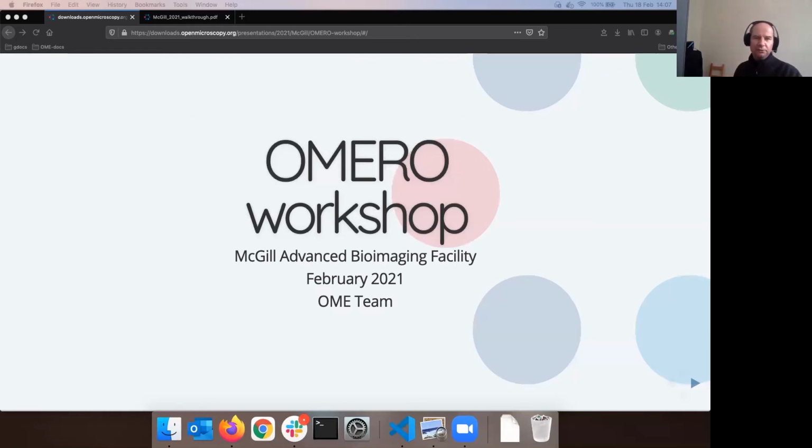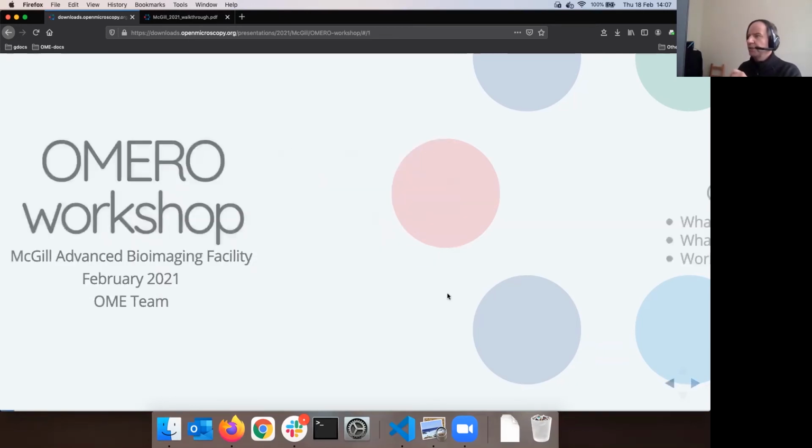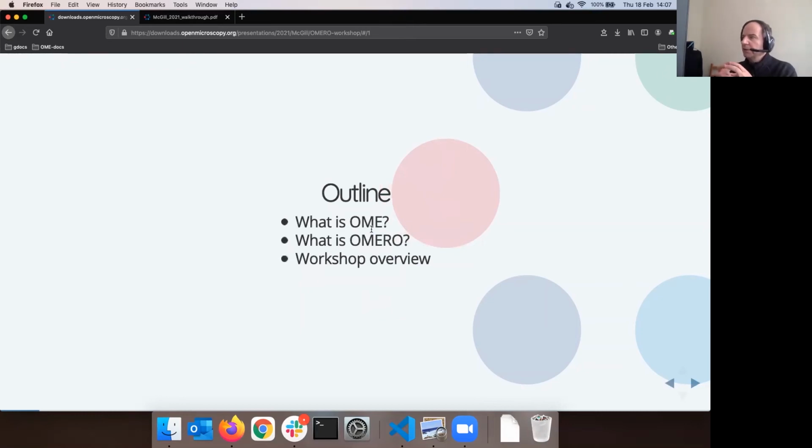So without further ado, welcome to the Omero workshop at McGill University in the Advanced Bioimaging Facility. First, a short presentation. I will tell you what OME is, which stands for Open Microscopy Environment, then what Omero is, and then I will give you the workshop overview. We will not bother with the presentation tomorrow, so bear in mind that the whole presentation now covers both days. Of course, they are intrinsically connected.